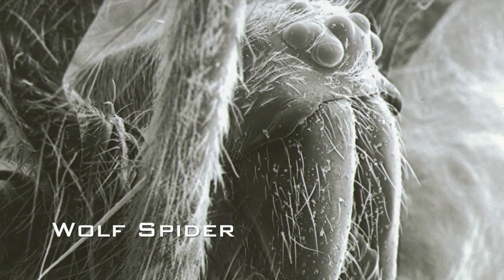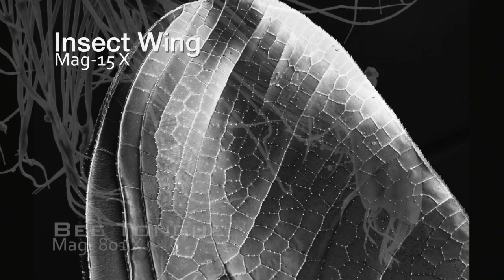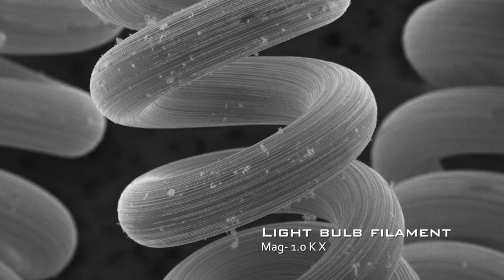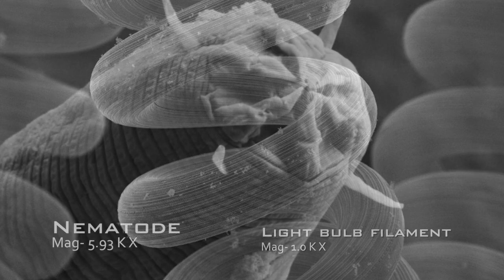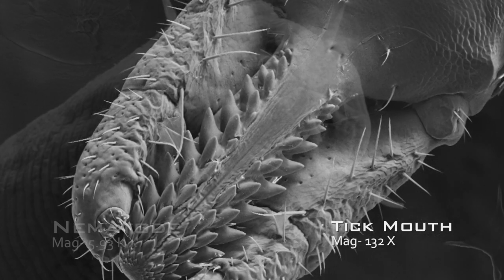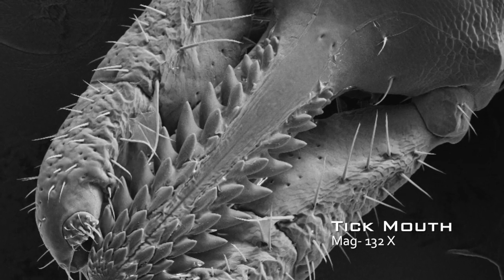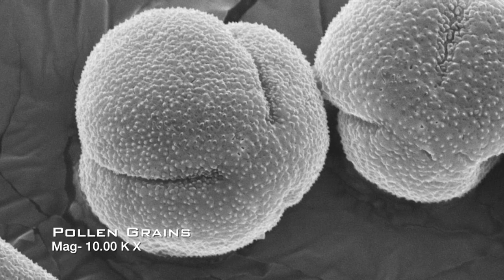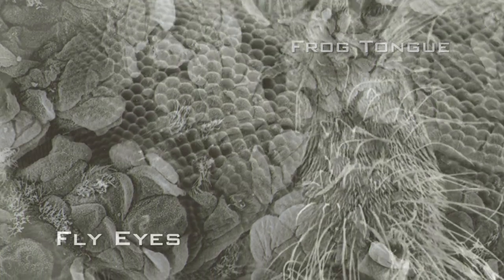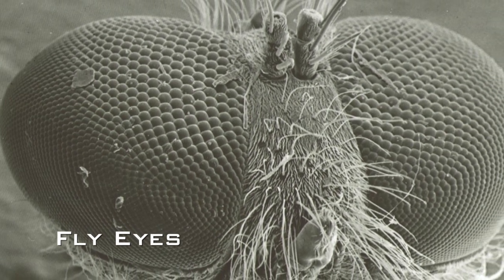Seeing the images produced by the electron microscope never gets tiring. Some of my favorite images include a bee tongue, a light bulb filament, a soil microbe called a nematode, and the mouth parts of a common tick found here in Arizona. You can get so much wonderful data from a single image, and it can really speak volumes about what you're researching and truly tell a story.